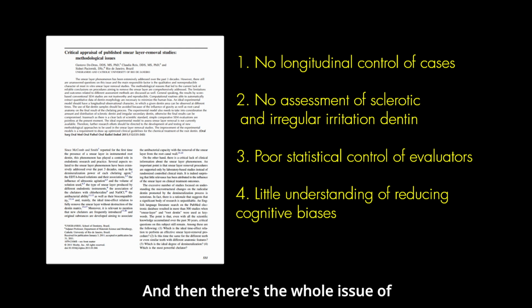And then there's the whole issue of bias. There's a tremendous amount of bias in SEM studies, and you want to be aware of the biases that you have: where to look, how closely to look, failing to look. I love the definition of what a mediocre scientist is: one that can always find what they're looking for. The good scientist finds what they are not looking for. So the whole issue of all of the cognitive biases we have looms large in image interpretation, and we will endeavor to minimize them as much as we can.